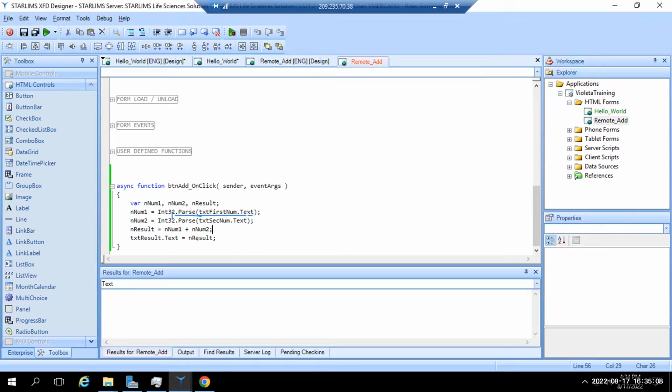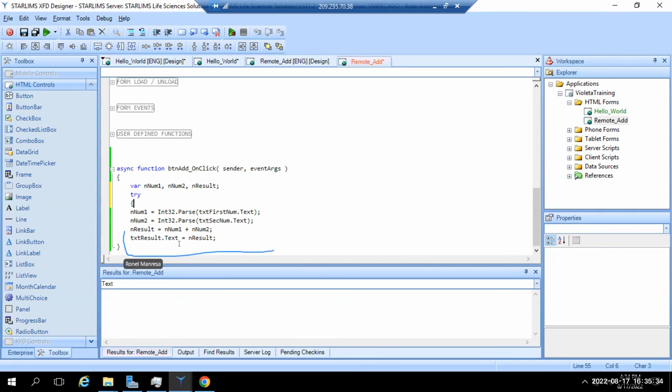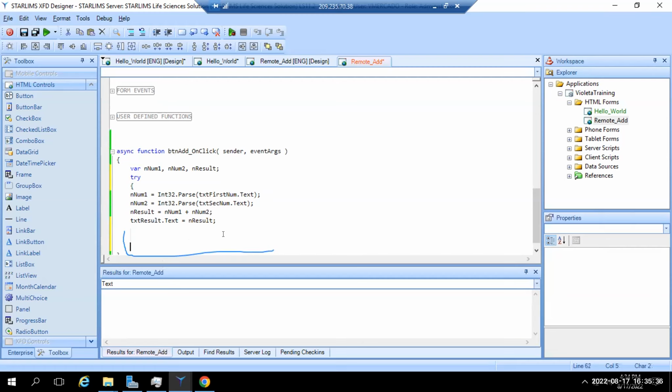So to clean this up in the final version of this, it would be try. So start, yeah. Give yourself a new line over here right after the declarations. Yep. Start typing in try. Okay, a new line. And then open a curly parentheses on the keyboard, the curly, no, the other one. Yep. This one. Okay. Slide all of this inside of the curlies. Making more space. Okay, and then indent this so the code looks nice.